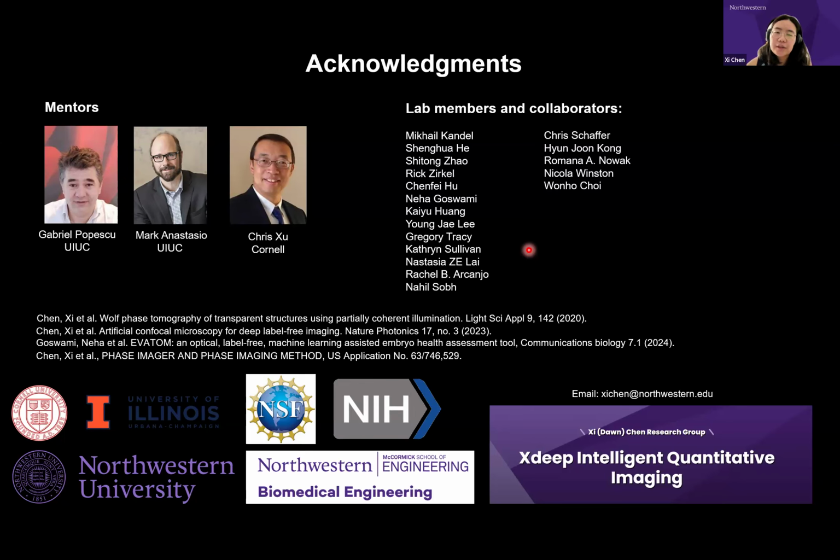So Z1, Z2, Z3. Those 3 Z's were input into the network, and the network trains on those 3 Z's, and we of course iterate through the whole Z stack. So Z1, Z2, Z3, and then Z4, Z5, Z6. All the way through the Z stack, we put it into the network, and the network also sees the colocalized pair, the other confocal fluorescence image. And after this is trained, you still do the same thing. You input 3 Z's, you output 1 Z. So this is the key: you input 3 Z's, the output is 1 Z.